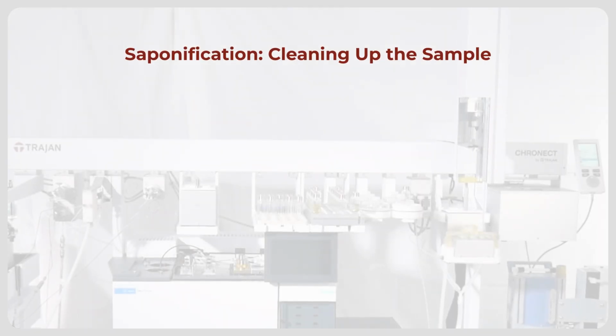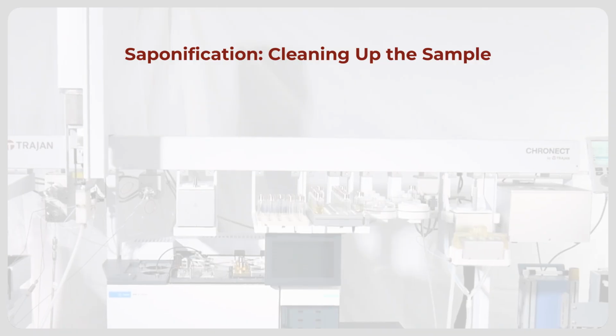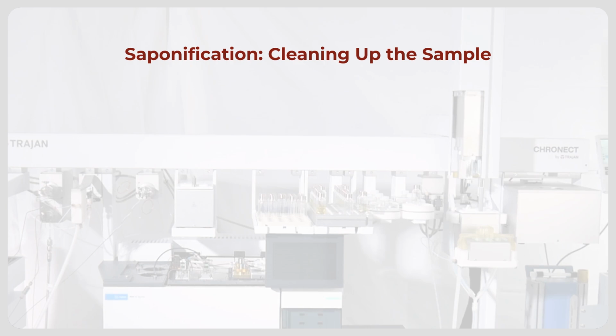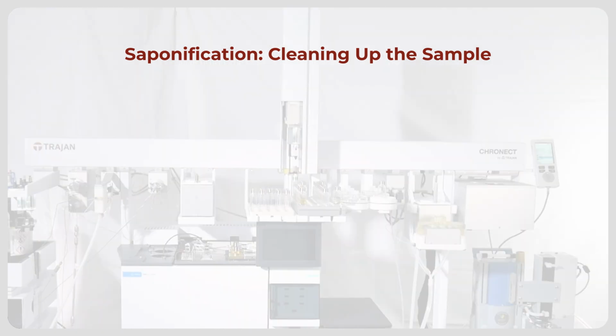When utilizing CHRONECT's MOAH Workstation, liquid-liquid extraction and saponification are seamlessly combined into a single, continuous step. This integration makes the workflow faster and more efficient than the traditional ISO method.